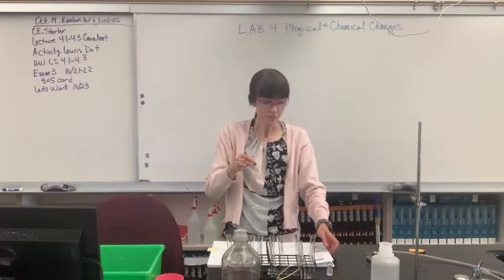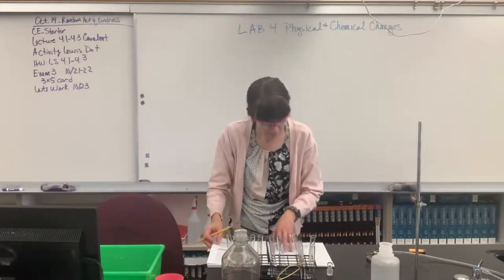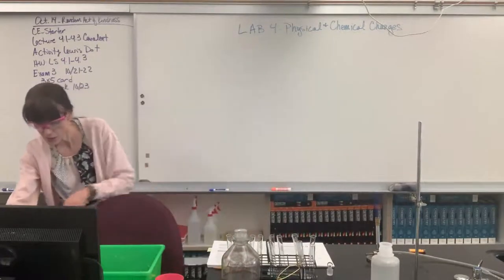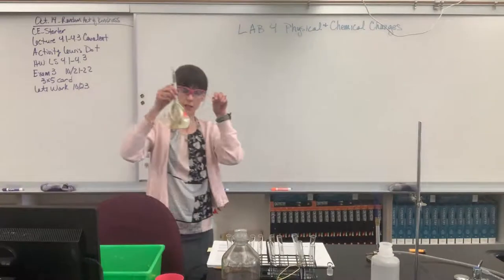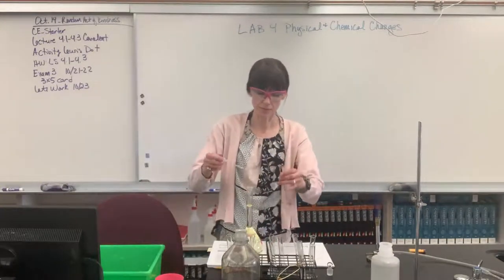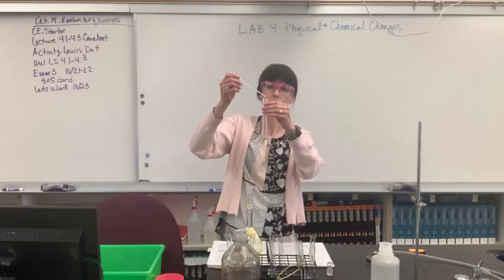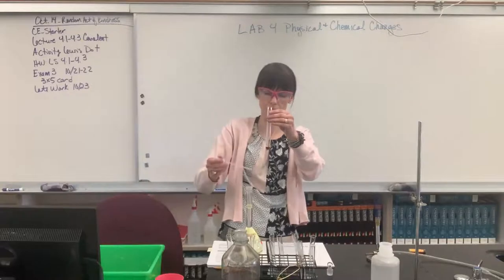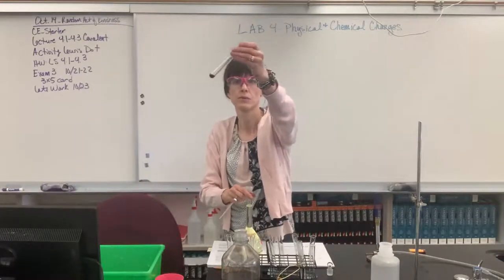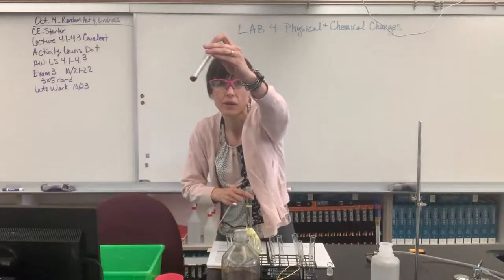Nice. Now let's do the ammonium thiocyanate, and that was 2 drops. Okay, my ammonium thiocyanate is right here. Let's do 2 drops into this one. One, two. Oh, yep. Beautiful red color. A really pretty red color.